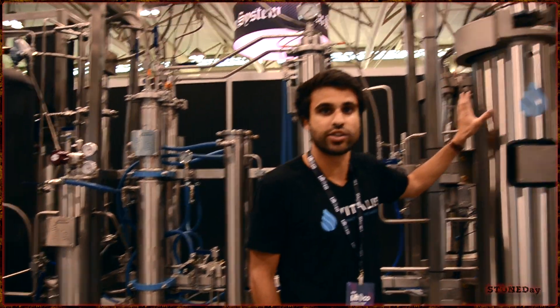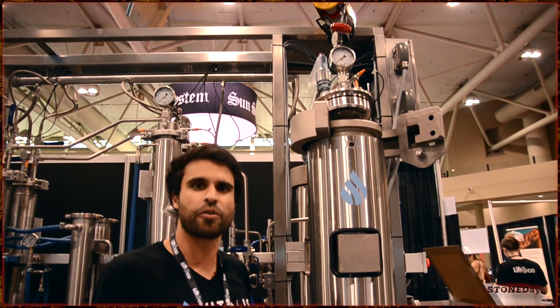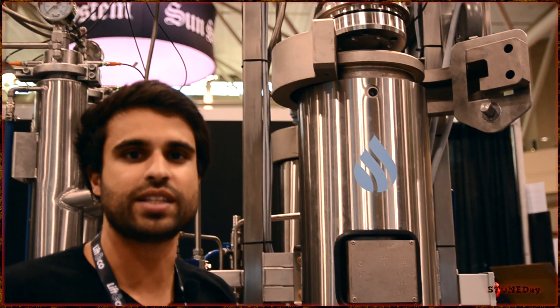After it's heated, the carbon dioxide makes its way to the extraction column. This extraction column is filled with your ground cannabis — it's about the consistency of coffee grounds. It enters through the bottom here, goes all the way up through the top, collecting cannabinoids, terpenes, and everything as it goes along.